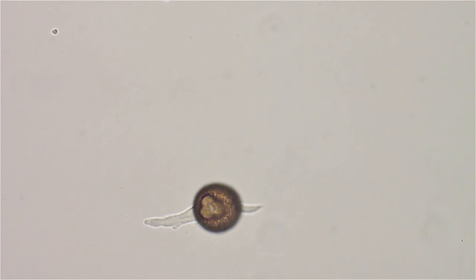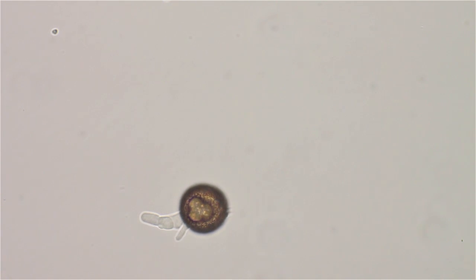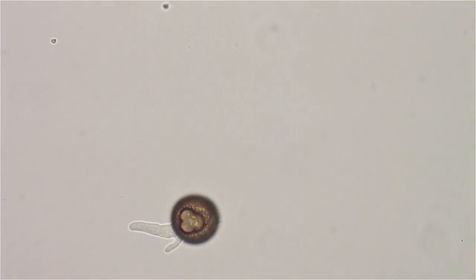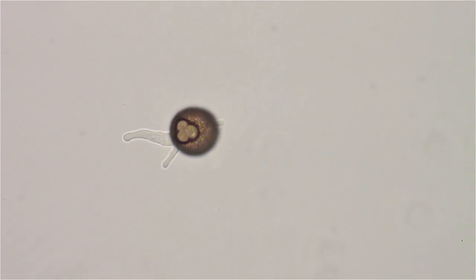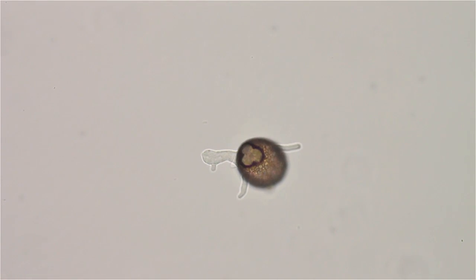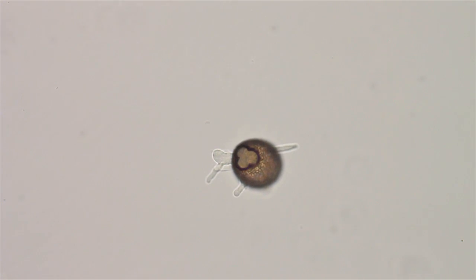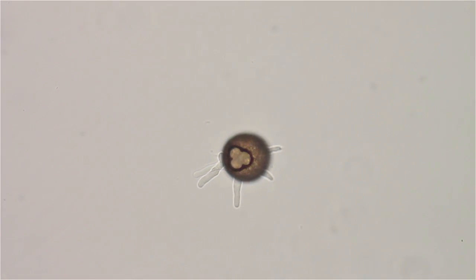He's got himself streamlined. This is using a 20x plan Apo lens Nikon, on the Nikon Fluopot. Let's switch to 40x.